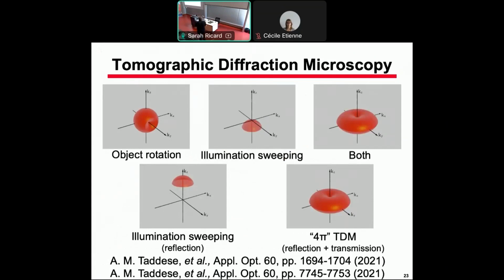So an important thing is optimizing the illumination. This was work about which a previous PhD student did, published in 2021.